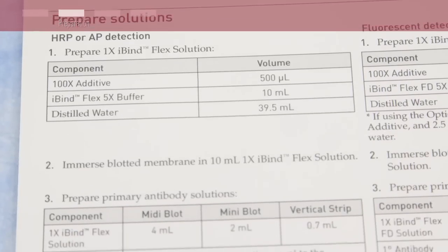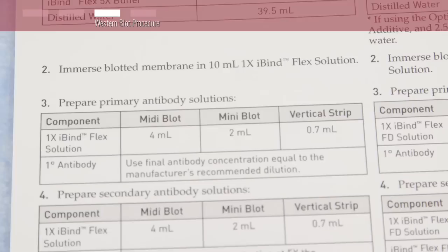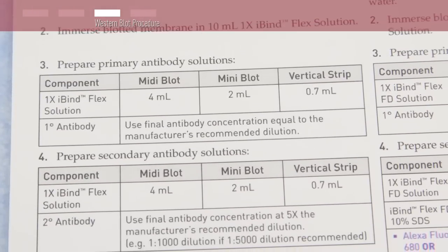To begin, prepare your 1X iBind Flex solution, your primary antibody solution, and your secondary antibody solution according to the quick reference card.